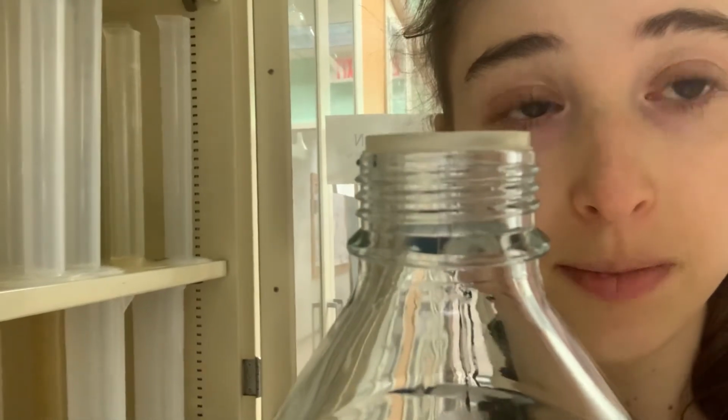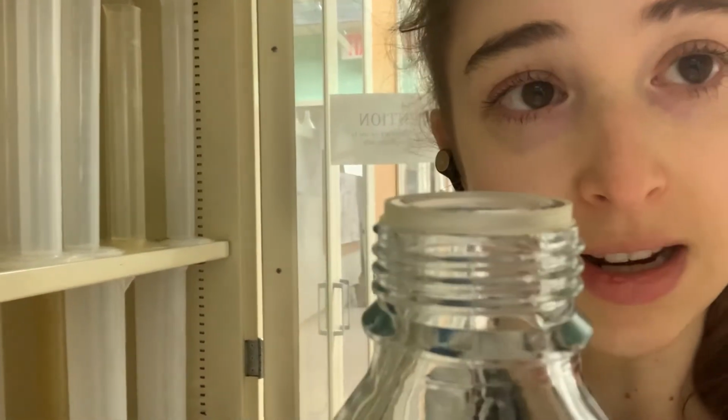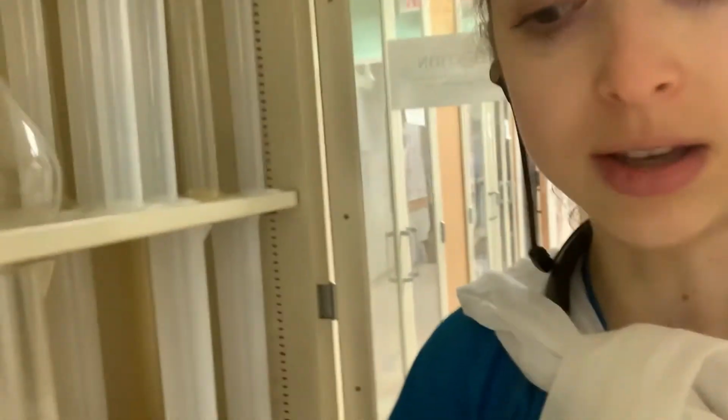So check the lid, and also check the rim of the bottle. It shouldn't be cracked, and it should have this plastic seal on it. If it doesn't, then it won't form a nice seal with your vacuum filter.